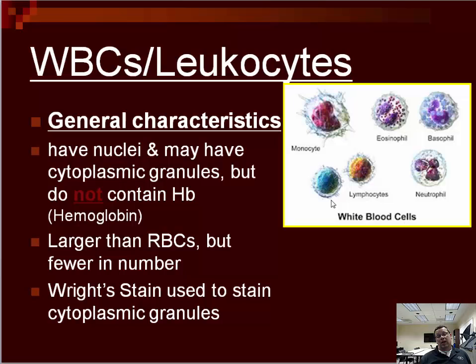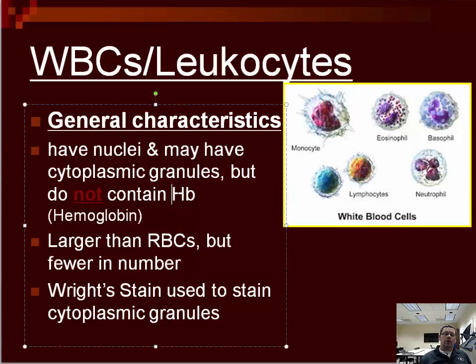Because they have a multiple lobed nucleus, they're called polymorphonuclear cells. So we're going to continue on and look at those neutrophils. You can see detail. Four of them here on the left of the screen. You notice that they have nuclei, and they are the most numerous cells. You also see in this field here the erythrocytes, which are red blood cells. The white space in between cells is liquid plasma. Remember, plasma is the matrix, and from histology, you should remember what matrix is.